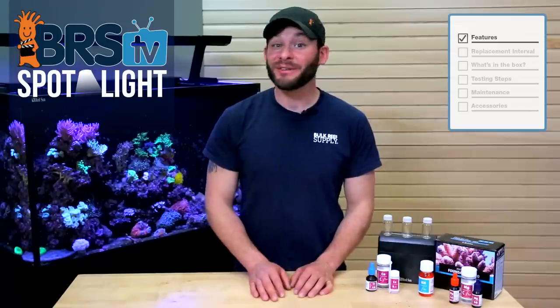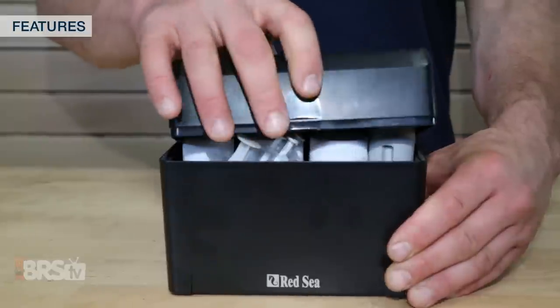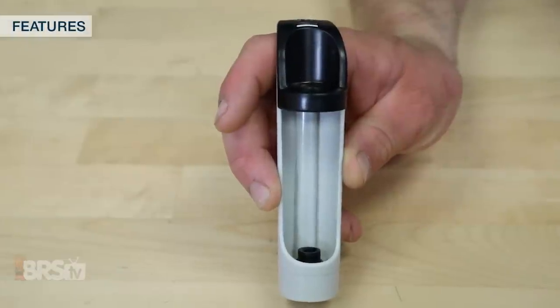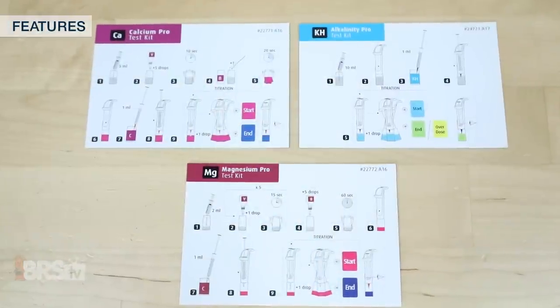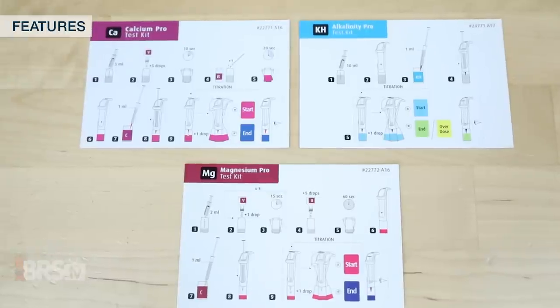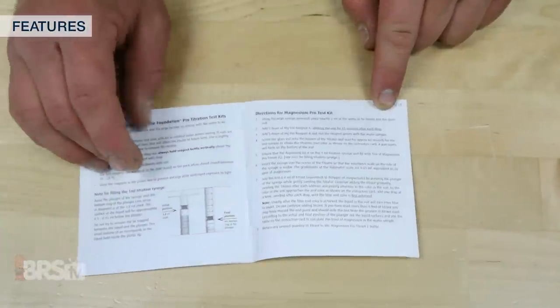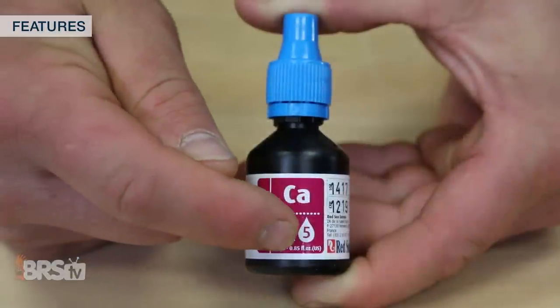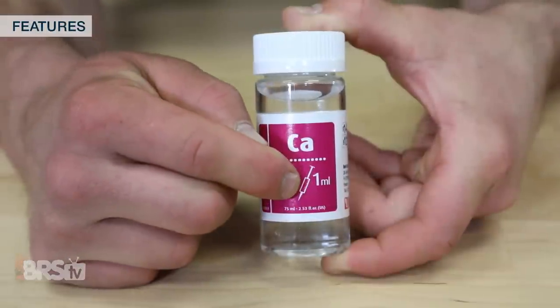With the Foundation Pro multi-test kit you get the same high quality that Red Sea is known for, with features like a hard shell case to keep out water and light, a titrator that can be operated with a single hand to make accurate testing easier, and laminated cards for each test with step-by-step photo instructions. Not only are there photo instructions for each test, but you also get a manual with the written versions, as well as the required reagent and titration amounts printed directly on their respective labels.